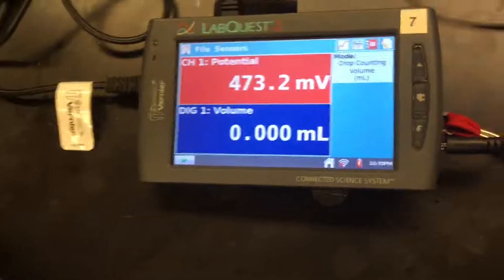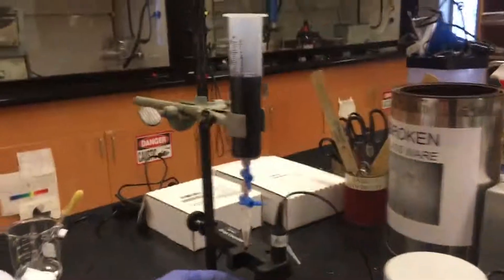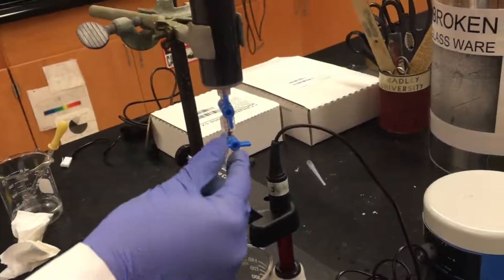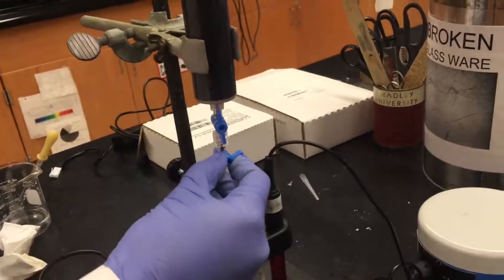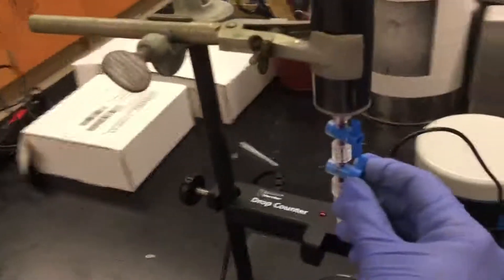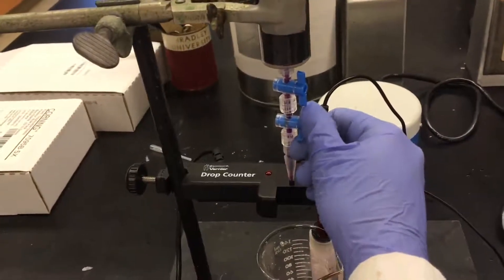So now Eilish is going to just run a few drops through the burette. There are two valves. One controls flow rate and one controls drip rate. And you're going to just test and make sure that that red dot comes on in the drop counter. So the red dot is coming on. So we know that it works, and we can shut it off.